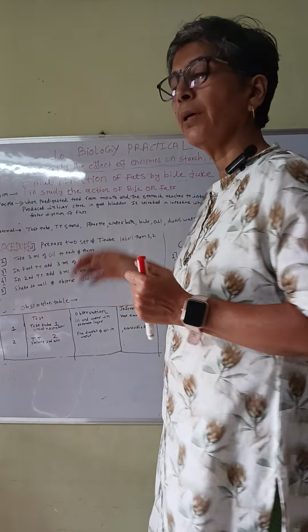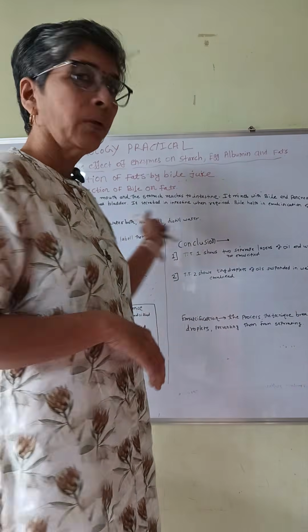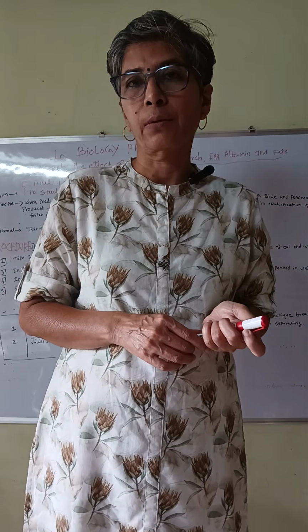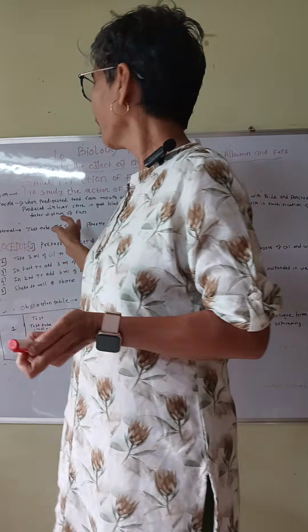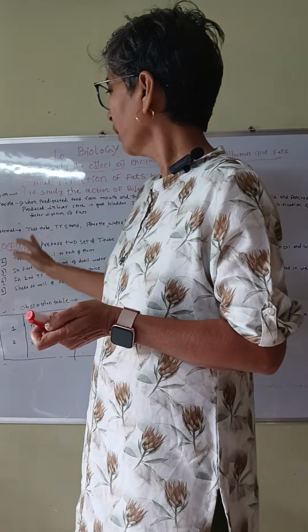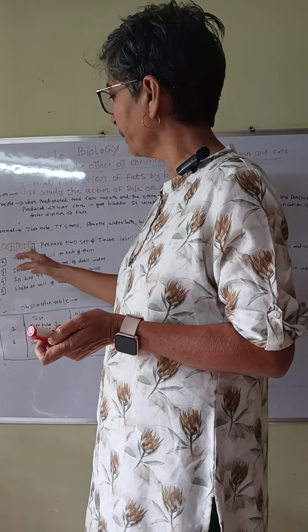So bile helps in emulsification of fat or oil, so the food gets digested faster. There is faster digestion of fats. This is the principle. Materials as usual: test tube stand, pipette, oil, etc.